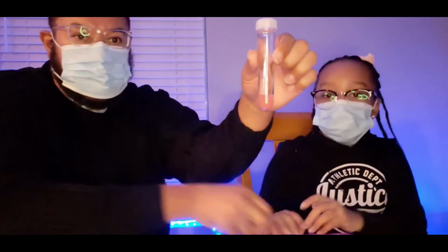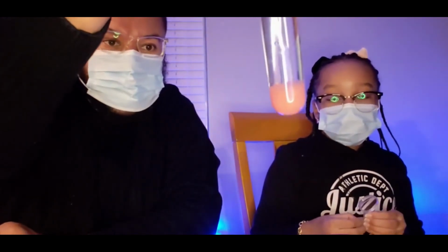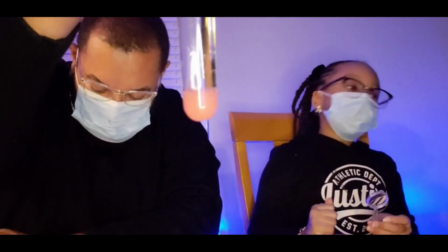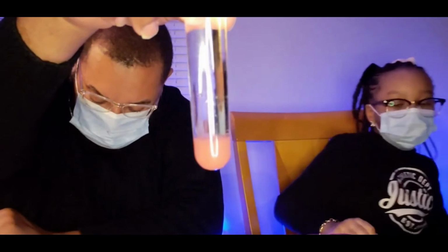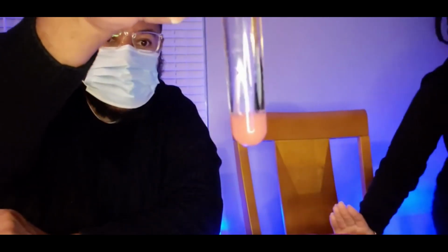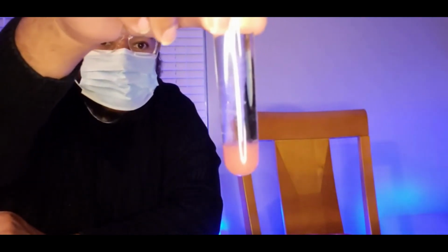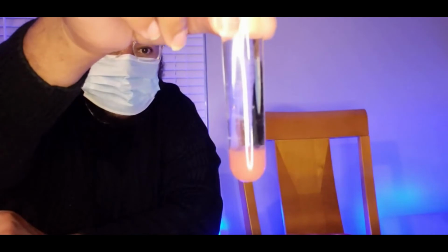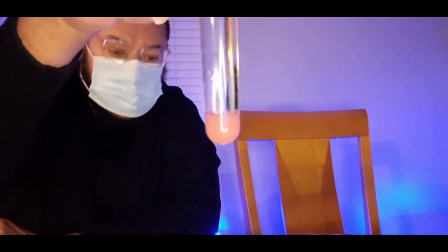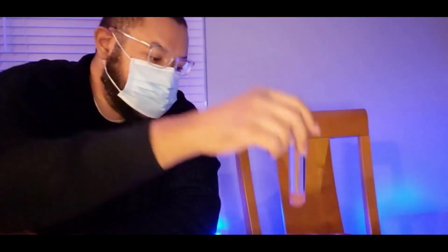So what we're supposed to do right now is let this sit for another 5 minutes. It's saying that white stuff on top is the DNA starting to separate, and you think you'll see it starting to float to the top. So I'm going to go wash my hands. What we should see here, after these 5 to 10 minutes, is a whole lot more strands coming apart, and we should be able to pick up those DNAs. So guys, we'll be right back after 5 to 10 minutes of this sitting.